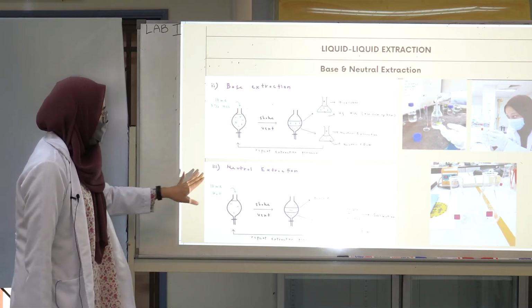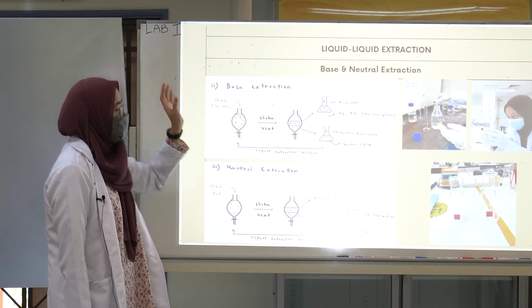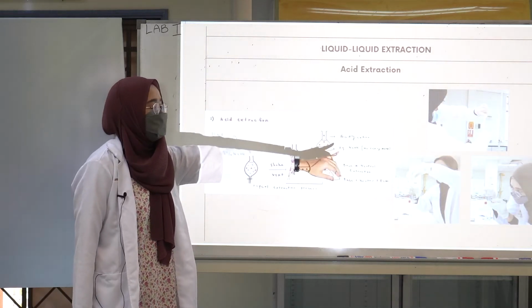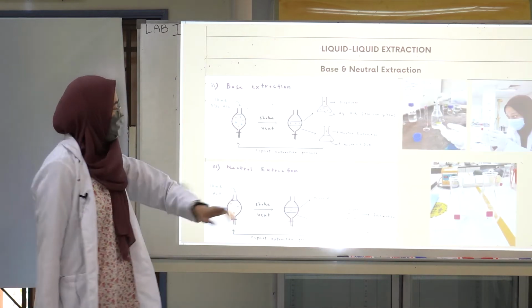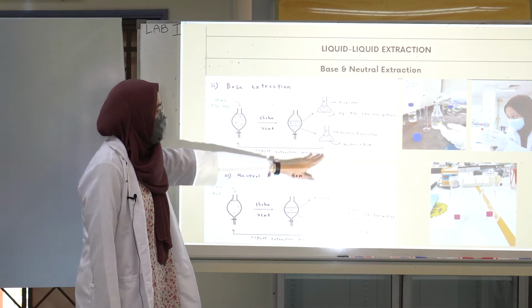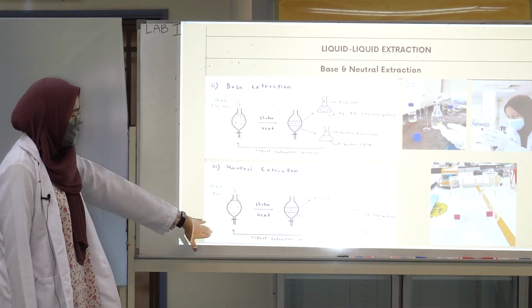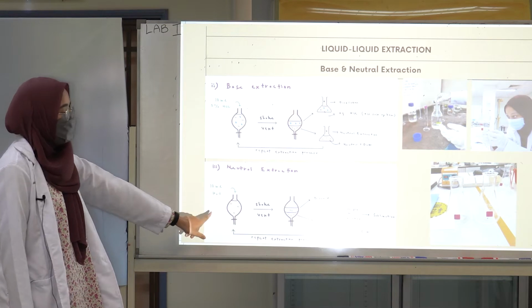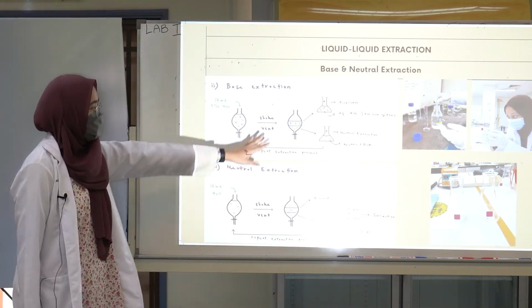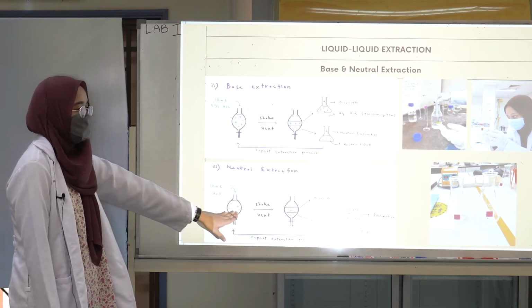Okay. So basically just now you say, can you go back? For acid here, we're going to go through acidification. Next, for base, we'll keep it for the distillation later. And for neutral extraction, we're just going to continue while you add 10 ml of water now into our neutral mixture right here. But you have to put it inside a different separating funnel.